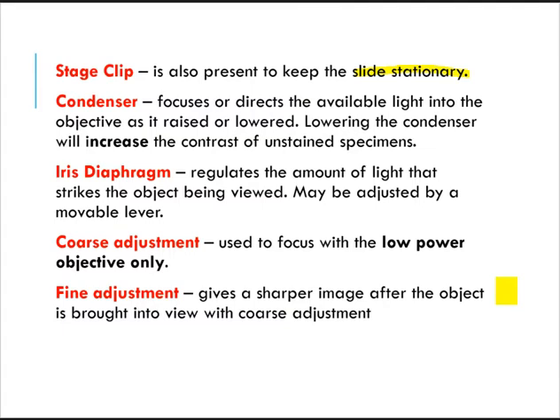We have your condenser. As I said a little while ago, it focuses or directs the available light into the objective as it is raised or lowered.